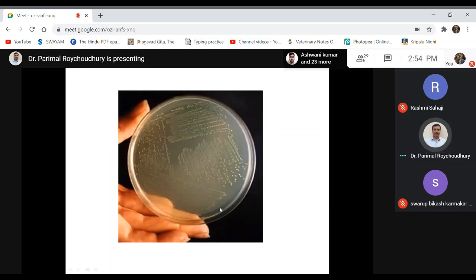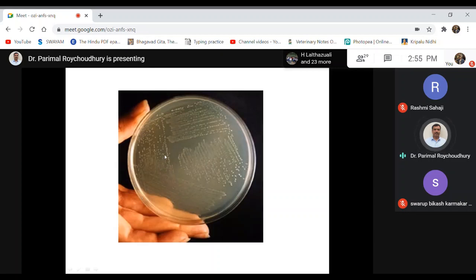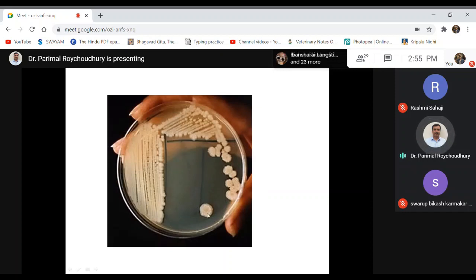Let us see here. In this culture plate, there are a lot of bacteria, and in this area also a lot of bacteria are present, but you can look through it. That means these colonies are transparent colonies. The light passes through this particular colony. On the other hand, here the light cannot pass through it. These are opaque colonies. So the transparent colonies are pinpoint, just like a water drop, and here the large colonies are opaque. These are some characteristics that we consider for identification purposes.